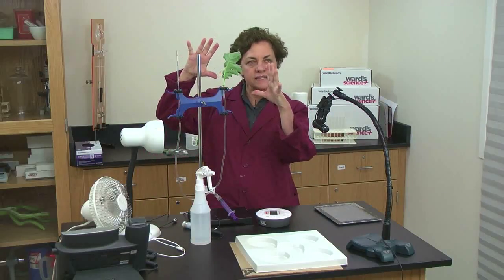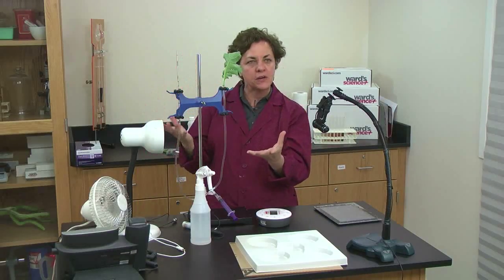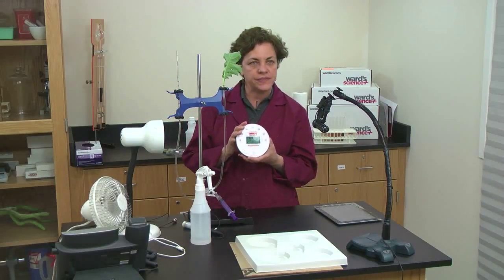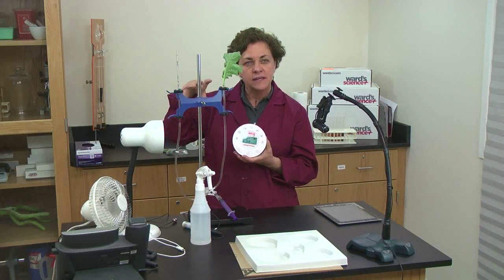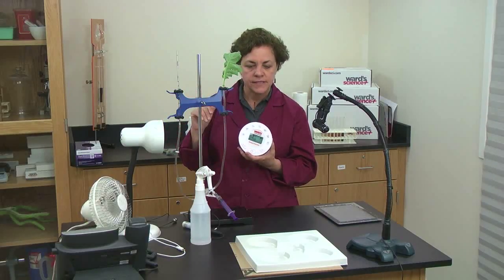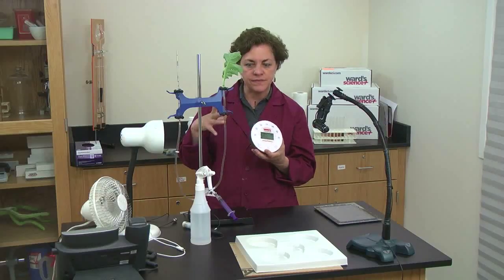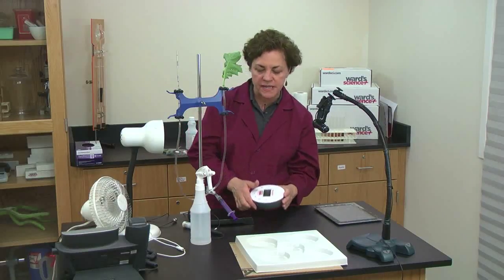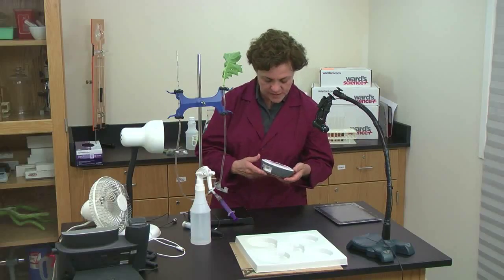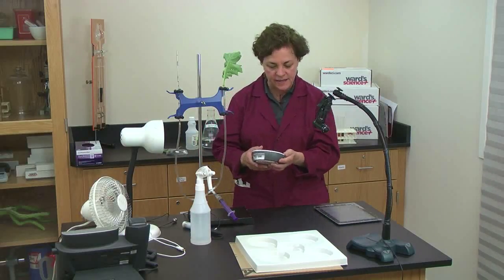If you're going to test the one where you put a bag around it, which is the normal way they've done it, you're going to have to put the Datahub into the bag, because it just wouldn't be in the same environment as the plant. So make sure that if you do that, you include this in the bag.